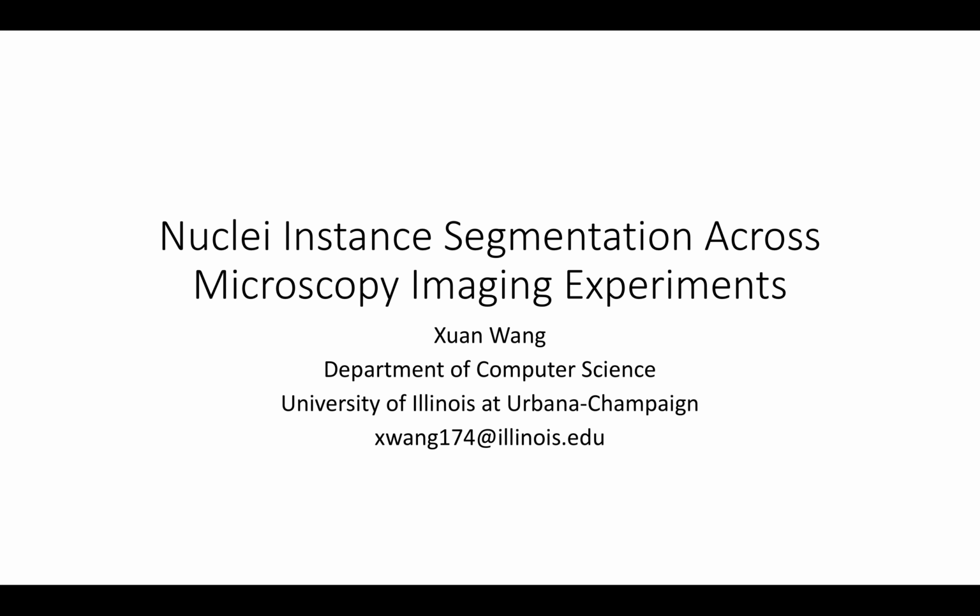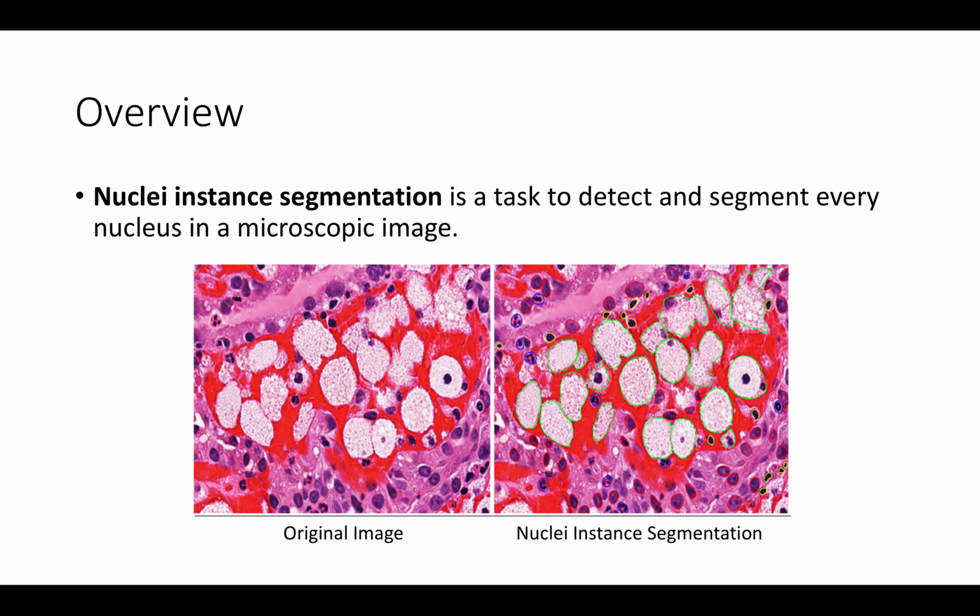This is Xuan Wang, and I'm going to introduce our project of nuclear instance segmentation across microscopy imaging experiments. The task of nuclear instance segmentation is to detect and segment every nucleus in a microscopic image.